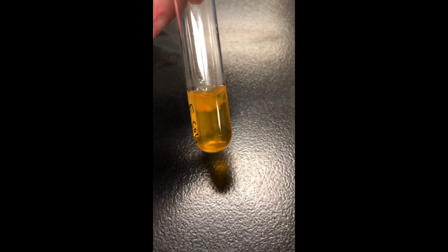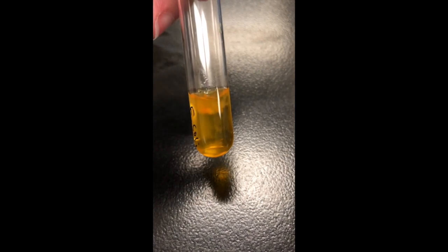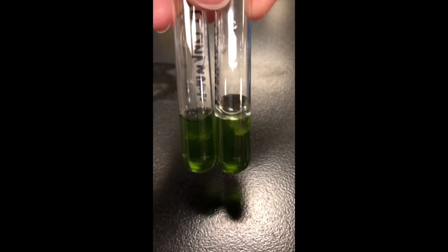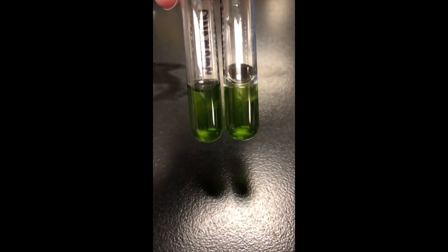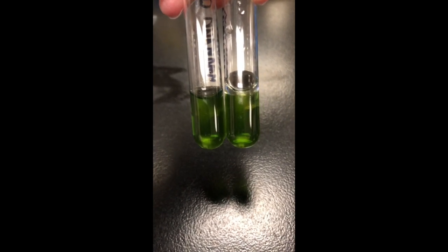Now remember, if only the O tube changes from green to yellow, that means our organism would be oxidative. But if neither change, that means our organism is non-saccharolytic. So based on that, what do you think your unknown is? Come check your results of your own when you have time and see if you got the same thing.